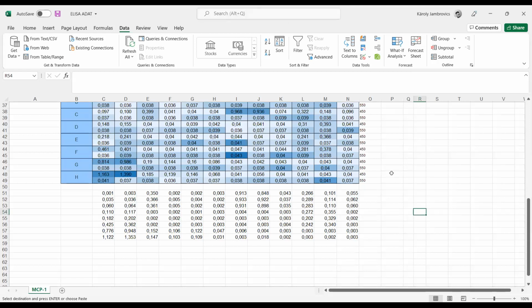So after you clean up your table, you need to remove the blank spaces. And now this is how it looks, where you took out the background value for the 550 ones. Usually when I'm making an ELISA, it is important for me to see in the very beginning, based on the absorbances, how the values will look.